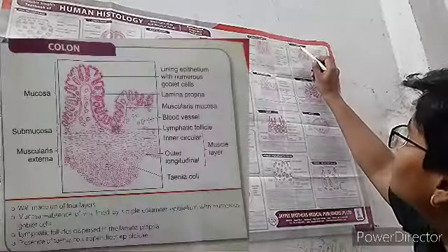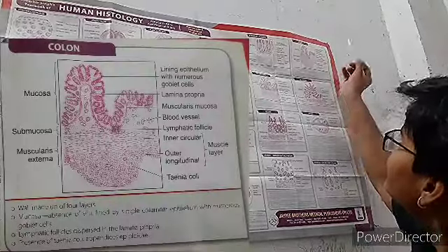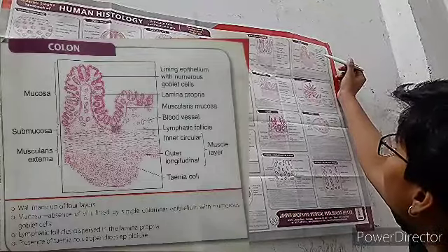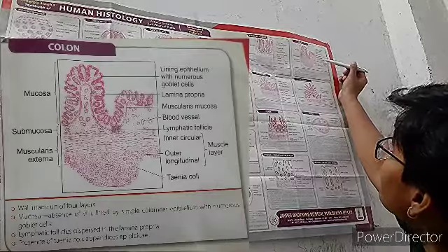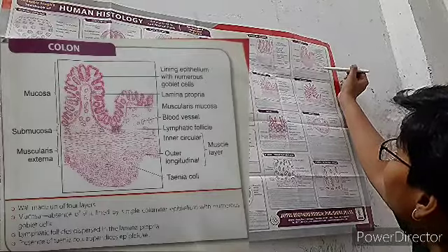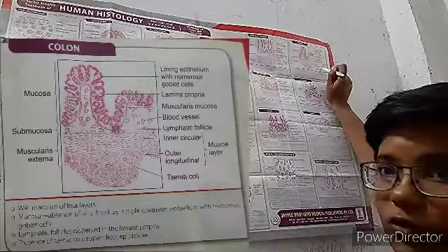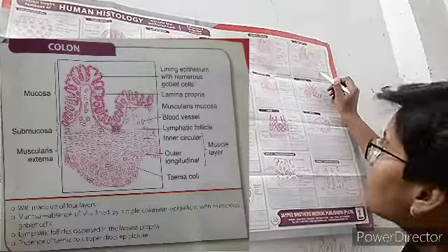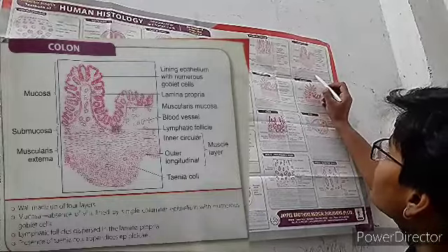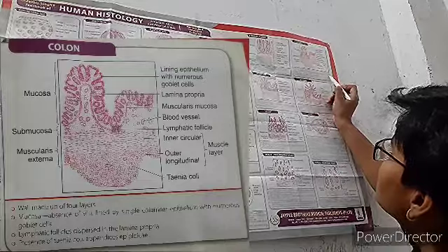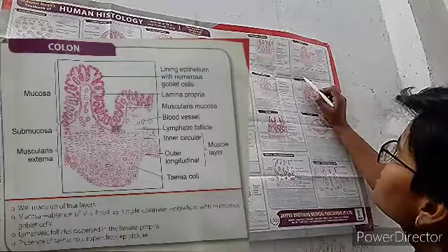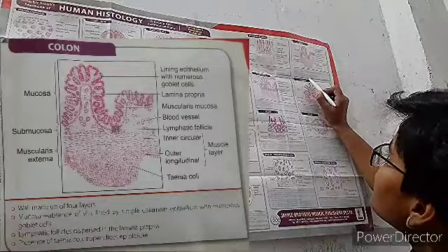Now the colon. Visible structures include mucosa, submucosa, muscularis externa, lining epithelium with numerous goblet cells, lamina propria, muscularis mucosae, blood vessels, lymphatic follicles, inner circular and outer longitudinal muscle layers, and taenia coli. The wall is made up of four layers. The mucosa shows absence of villi, lined by simple columnar epithelium with numerous goblet cells. Lymphatic follicles are dispersed in the lamina propria. The presence of taenia coli is a distinguishing feature of the colon.